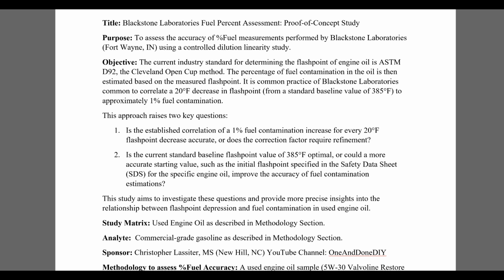In this case, it would be gasoline inside of engine oil. This is not the ideal way to do this, and the reason I'm saying that is because I use engine oil from my truck. I mean, you would probably submit virgin oil samples. Again, this is more of a proof of concept study. This is just to say, what happens if we spike gasoline into motor oil? Can we get a linear response? Do the numbers make sense? So that's the motivation behind this.